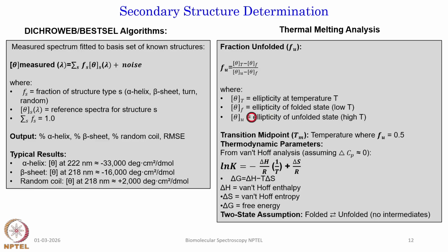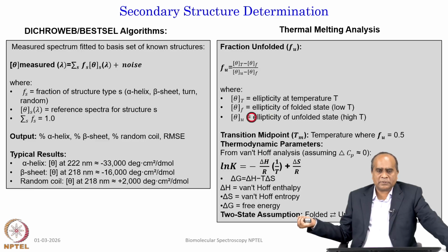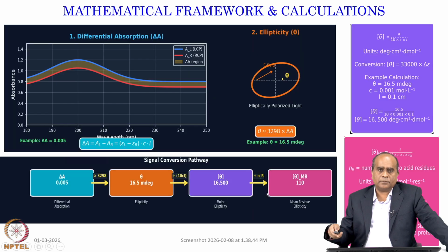Where are you going to use this? Say we produce the protein at 4 degree, right, we all the time do in a cold room or on ice, but the application of the protein is at a different temperature. So, this simple analysis helps you know, at 45 degree for industrial application, whether my protein is folded or not. Such analysis you can do by just measuring the protein stability or fractional folding using circular dichroism, right.